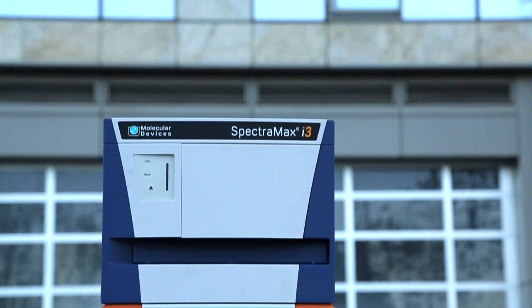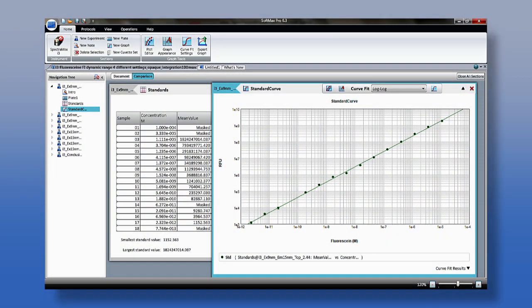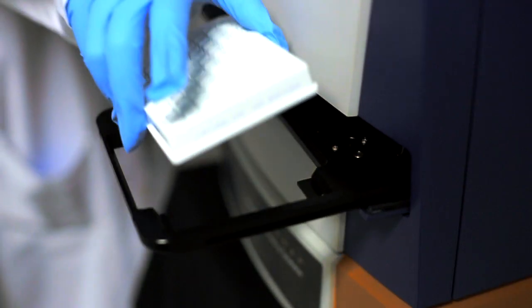The SpectraMax i3 system features an extended reading range for fluorescence spanning to seven decades. It uses our patented Auto PMT feature and LED power adjustment, maximizing both sensitivity and dynamic range.